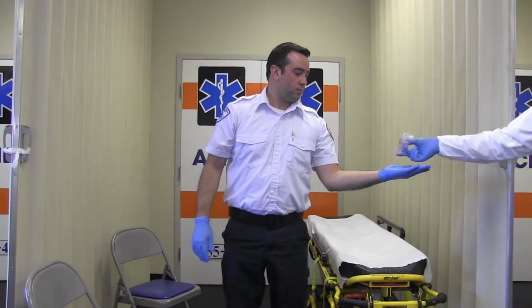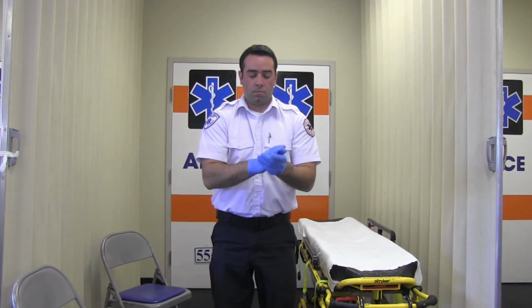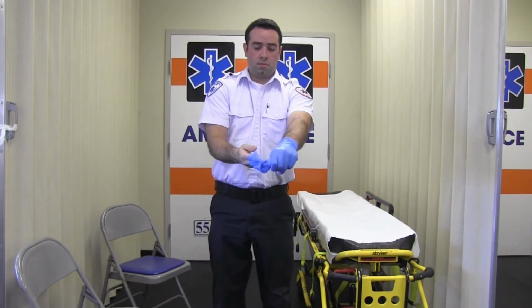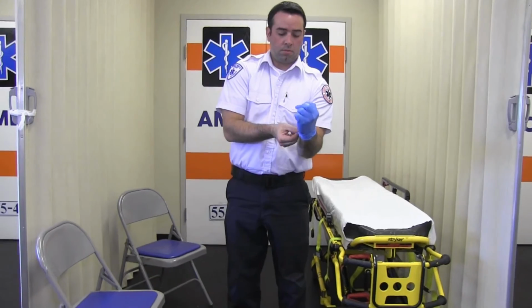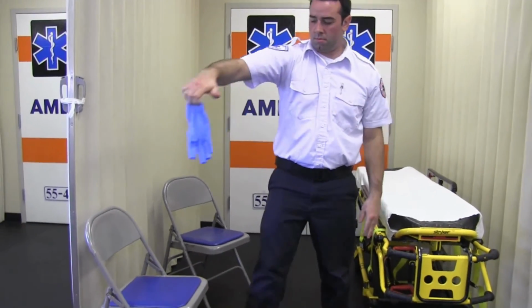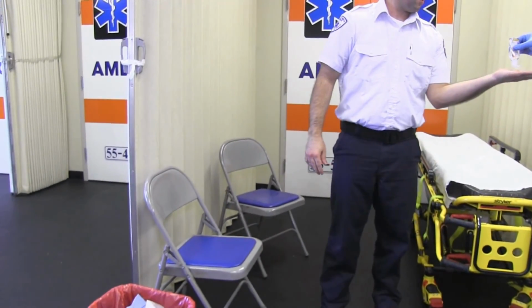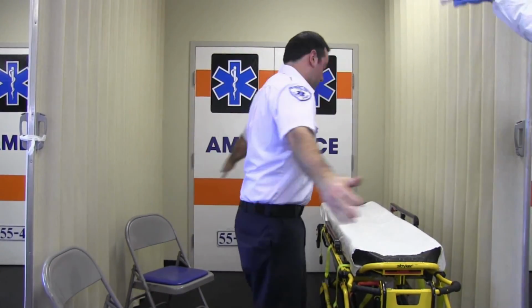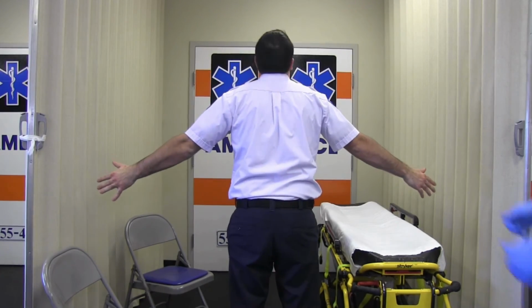Now you will disinfect your gloved hands with an alcohol-based hand rub. Remove and discard your gloves, taking care not to contaminate your bare hands during the removal process. Once your gloves are removed, you'll again perform hand hygiene with an alcohol-based hand rub. The final step in doffing is to perform a final inspection for any indication of contamination of your uniform.